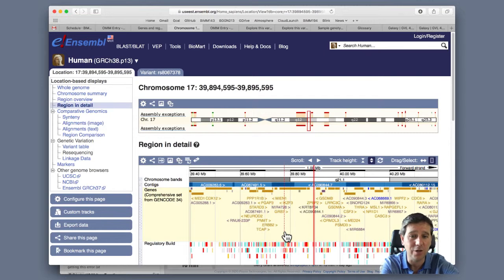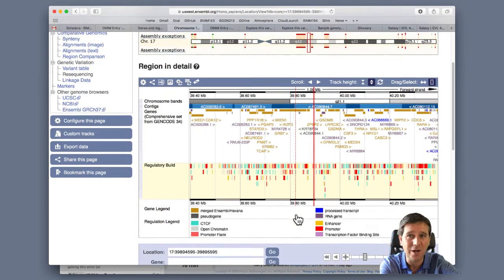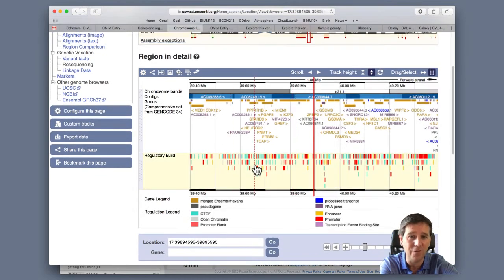There's a lot of stuff shown here. There's all these tick marks that show different information. There's all this color coding of features in this region. Actually, the kind of gold or brown color that's coming across on my stream here, these are the genes, right? The gold standard genes. This kind of brown colored thing.